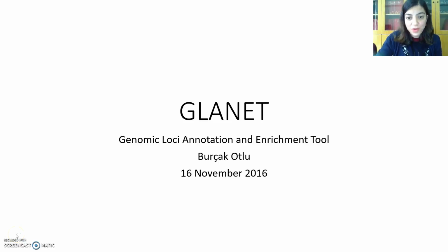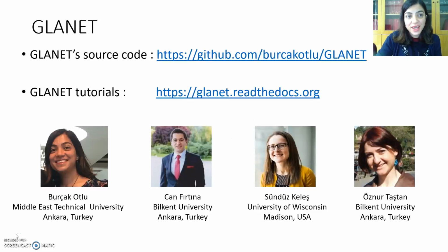Today I want to talk about our tool GLANET, which stands for Genomic Loci Annotation and Enrichment Tool. GLANET is a desktop application which is developed in Java. It comes with its graphical user interface. It can also run on command line. Its source code is available at GitHub and tutorials are provided at Docs.